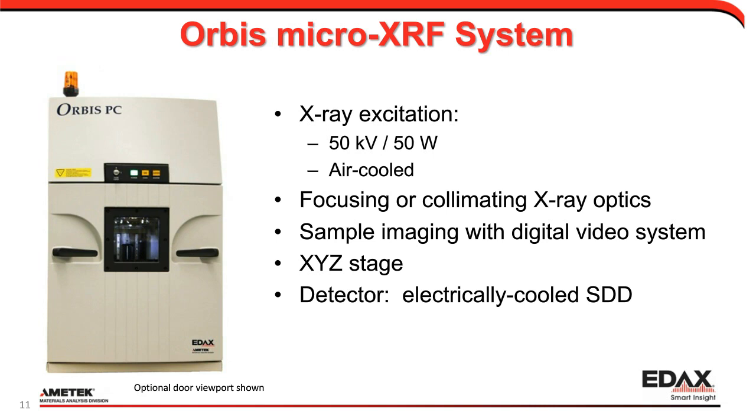It employs focusing and collimating X-ray optics. Focusing X-ray optics concentrate the excitation down onto small sample fragments, so we can get very good sensitivity on small fragments. Collimators are made by drilling a hole through an X-ray beam stop, and we do this to create larger analytical areas so we can get an average analysis of a larger amount of material.